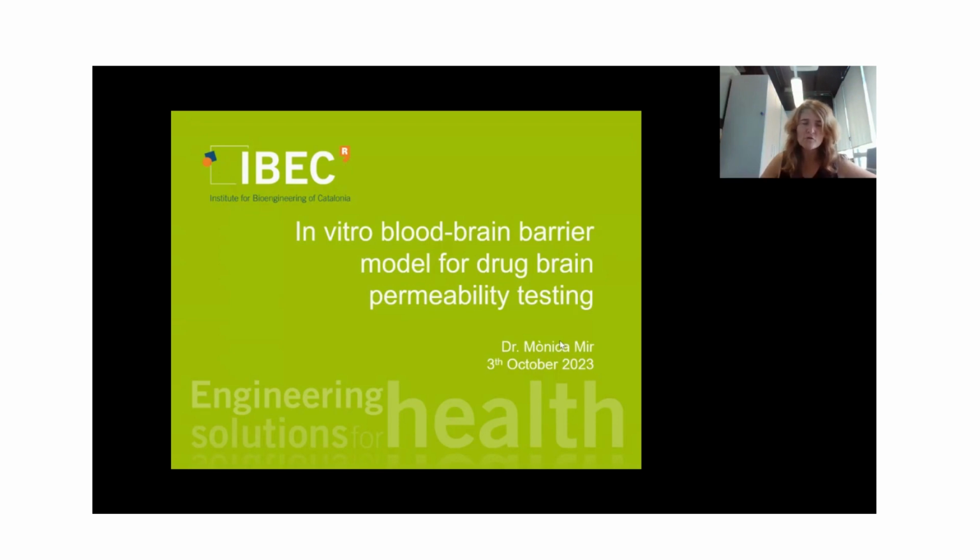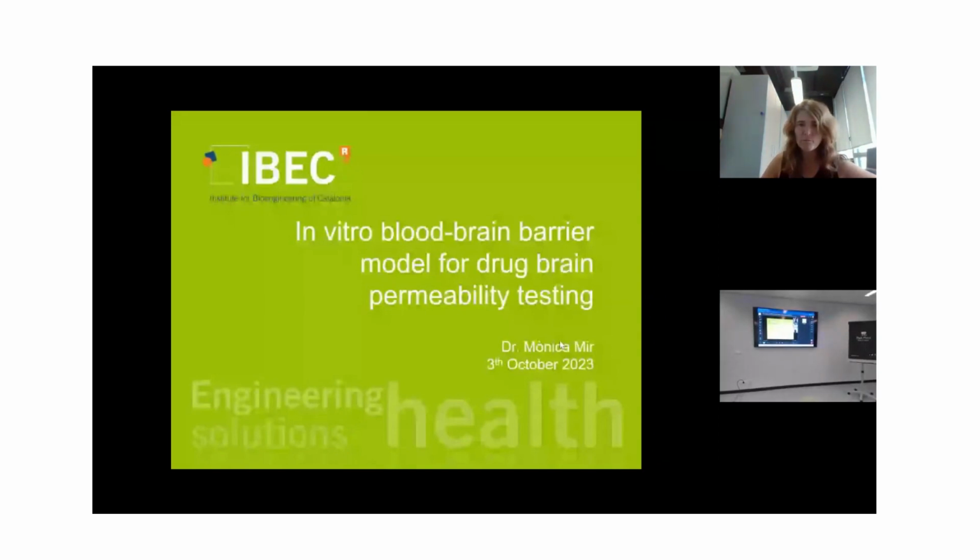Today I'm going to introduce a kind of tool for working in the study of drug delivery, specifically in the brain. That's the in vitro blood-brain barrier model for drug brain permeability testing.